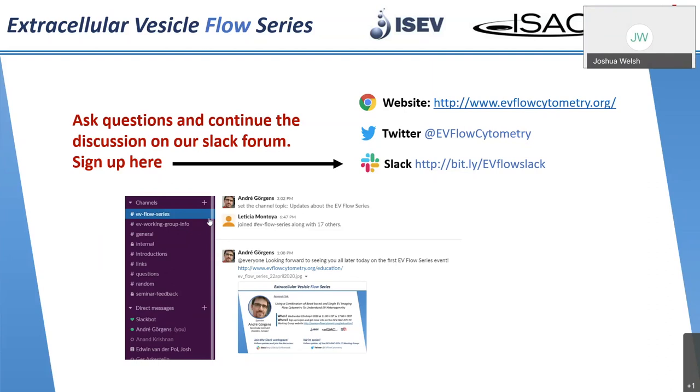That's a good question. For isolation methods, we have evaluated different ones, mostly variations of this ultrafiltration and size exclusion approach. But basically, with the bead-based system, we did not see any method that is extremely disqualifying. However, as said, it's semi-quantitative. So if you want the full picture, it would be better to use another approach. In terms of quality, I never saw a huge difference, even though we did not have a super comprehensive look. In terms of quantity, you definitely see huge differences based on the method you use. Let's say from yield or recovery, how much you lose in each method, how scalable things are, and how operator dependent those methods are as well.